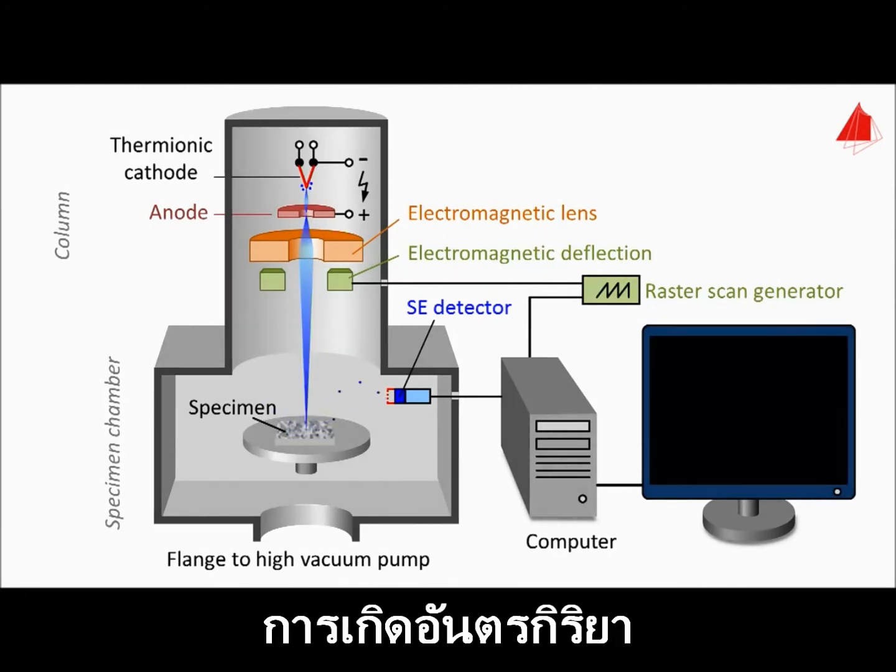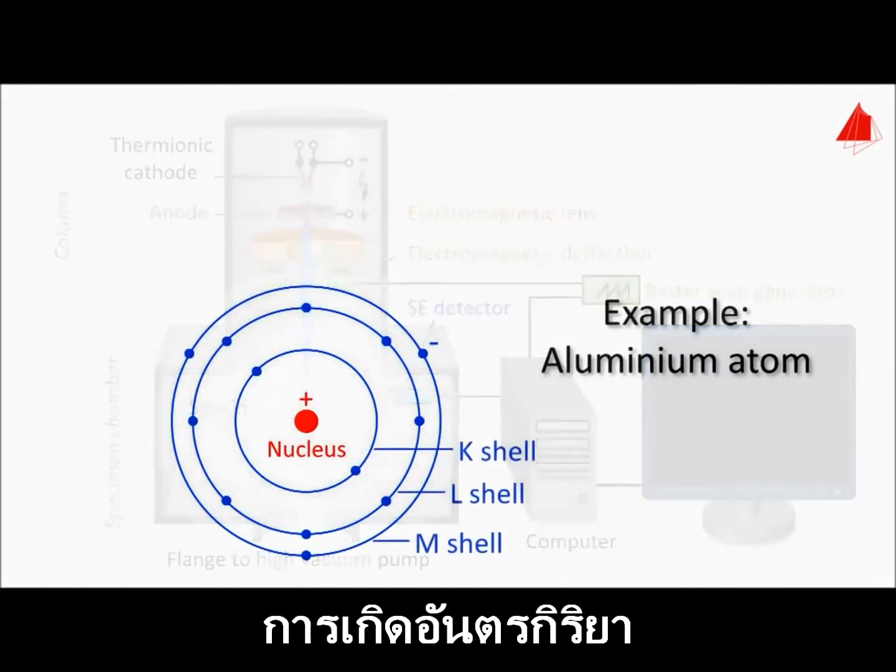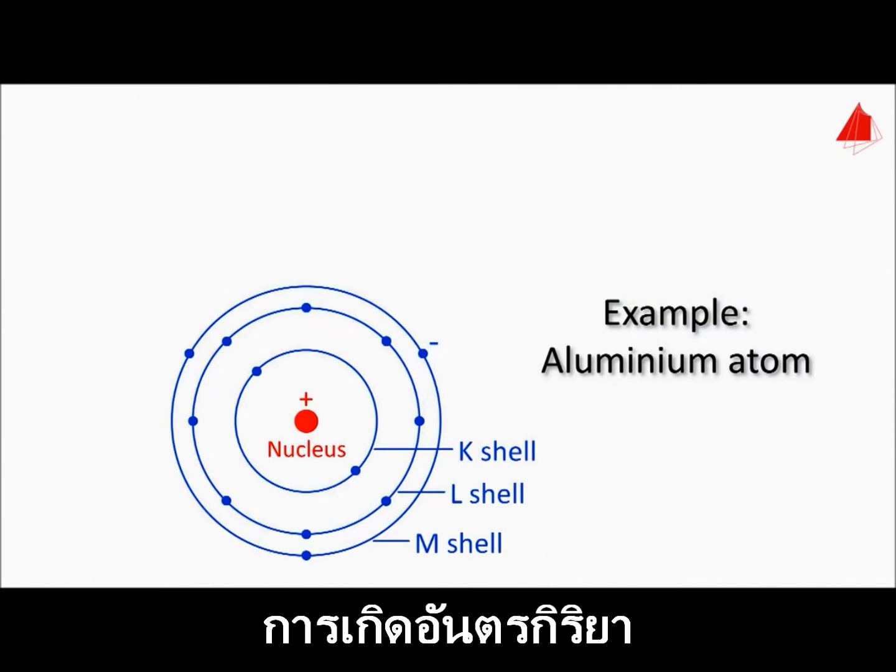The fast electrons of the electron beam, the primary electrons, reach the surface. They knock out electrons of the specimen material. These are the secondary electrons used for image formation. What happens in detail shows a schematically drawn atom from near the surface. Just like any other atom, it consists of a positively charged nucleus and negatively charged electrons. The electrons stay in energetically well-defined shells around the nucleus.